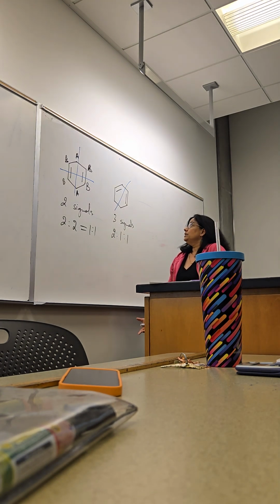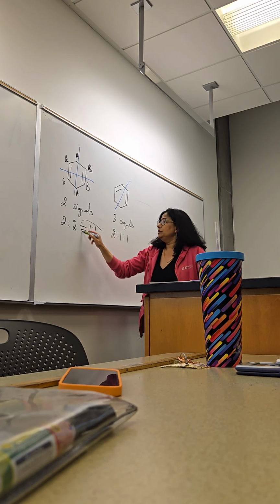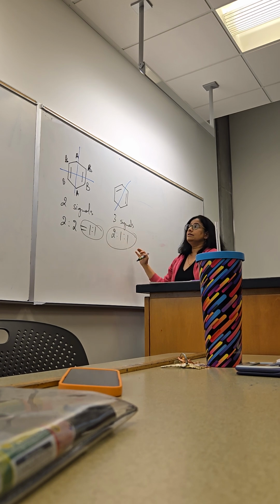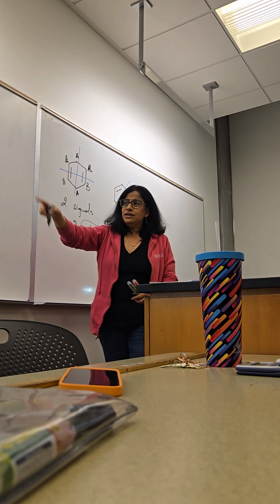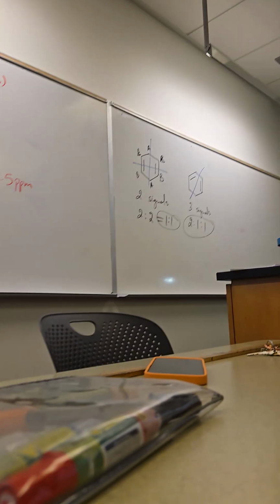Actually, that alone is pretty good to differentiate between the 2 compounds. You got only 2 signals with about equal integration. You got 3 signals with that integration alone. We'll be able to say whether it's this or that, right? Everybody okay? Yep. So that's kind of what we are doing in these examples. I'm not going to go through all of them, but that's kind of what we are doing in this question: we are looking at the differences that help us identify one or the other as the compound.